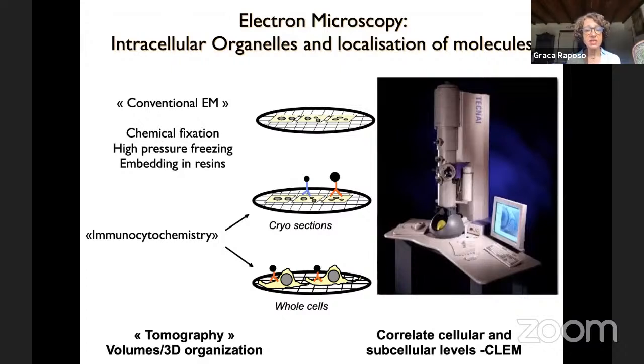and as you'll see later, when we want to preserve antigenicity of the components, and this is what I show here as immunocytochemistry to localize molecules in the samples. In this case, sometimes we use only paraformaldehyde because the antigens can be destroyed by the use of glutaraldehyde. They are not destroyed, they are just too fixed to be recognized by the antibodies.